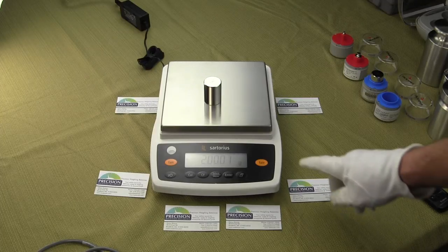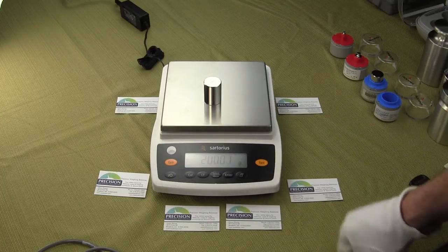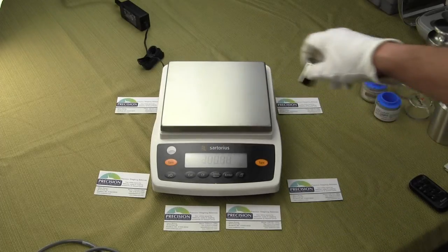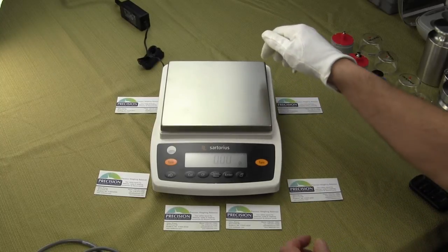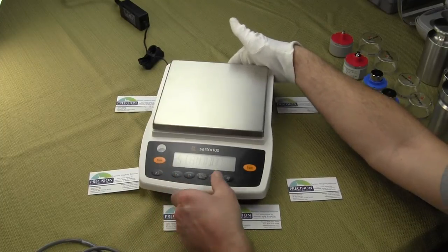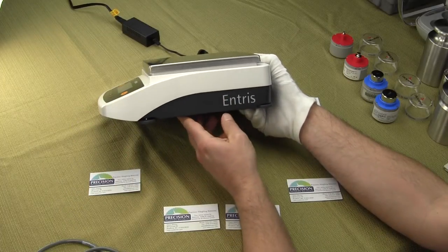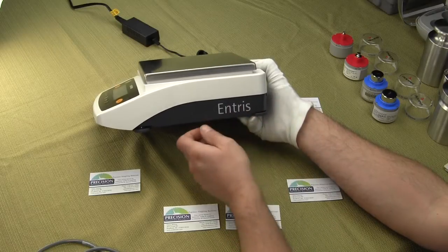They also changed the overlay on the ED series and GW — this was white, you'll notice it is now black. And on the right-hand side of the balance, to follow the theme of Sartorius' new series of balances, they have the series name on the side. So the balance is marked for the series. If you bought a Practum series, you would see Practum.